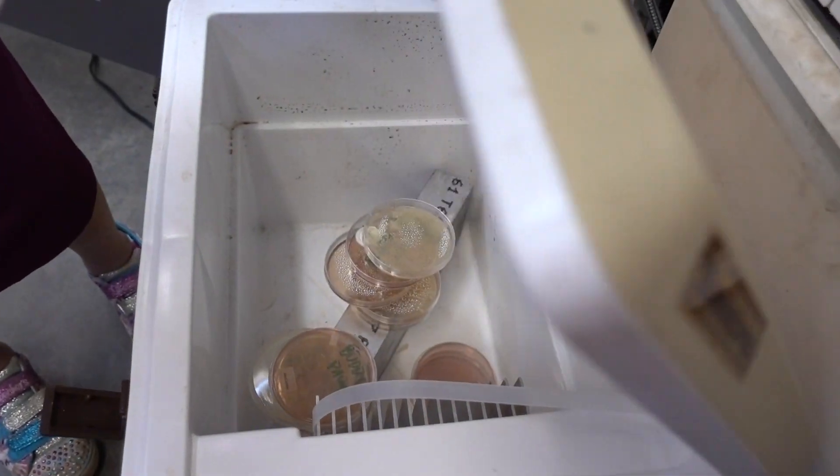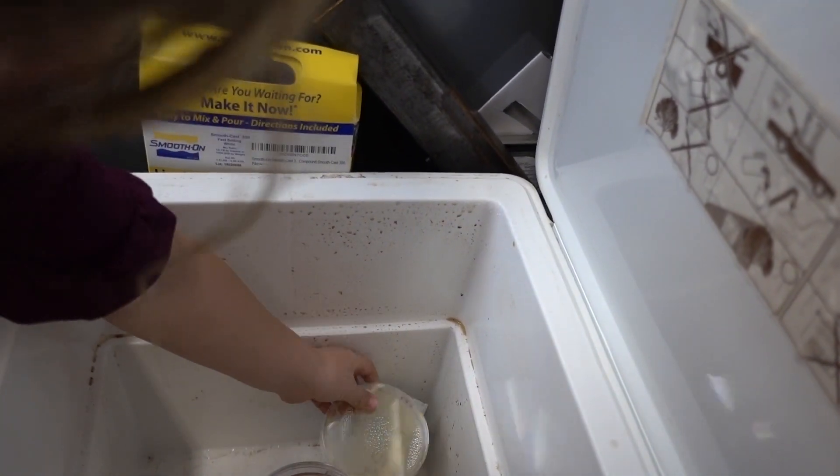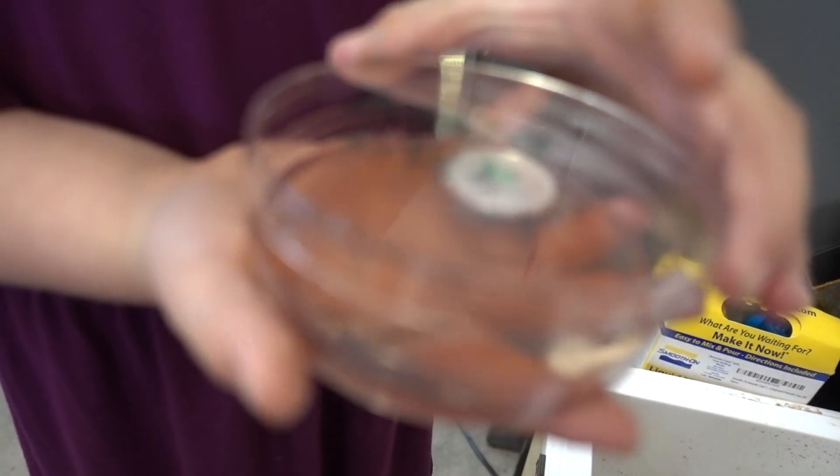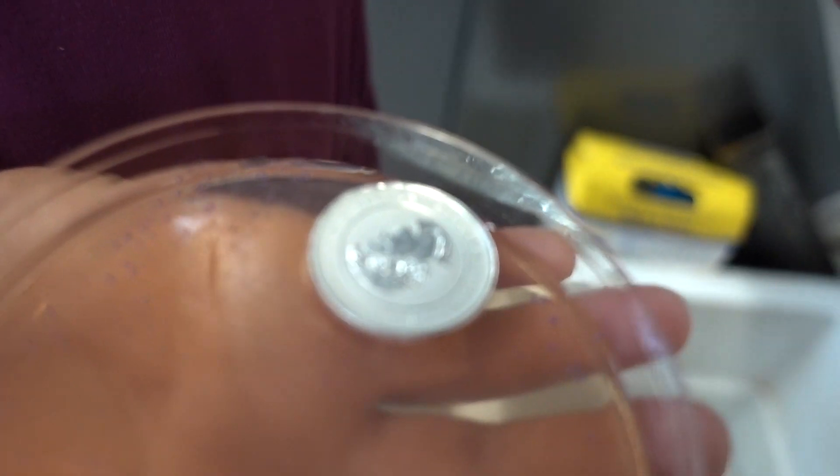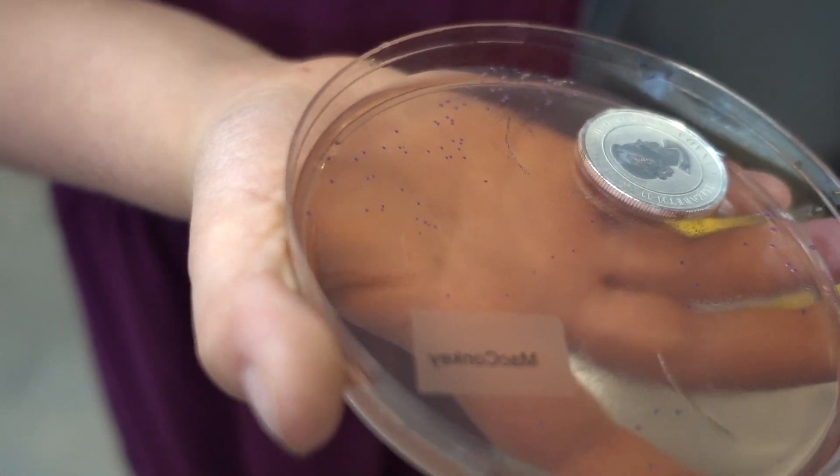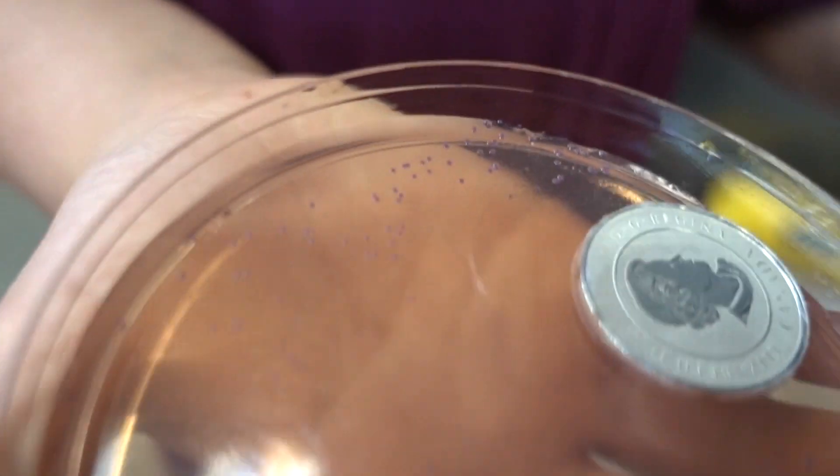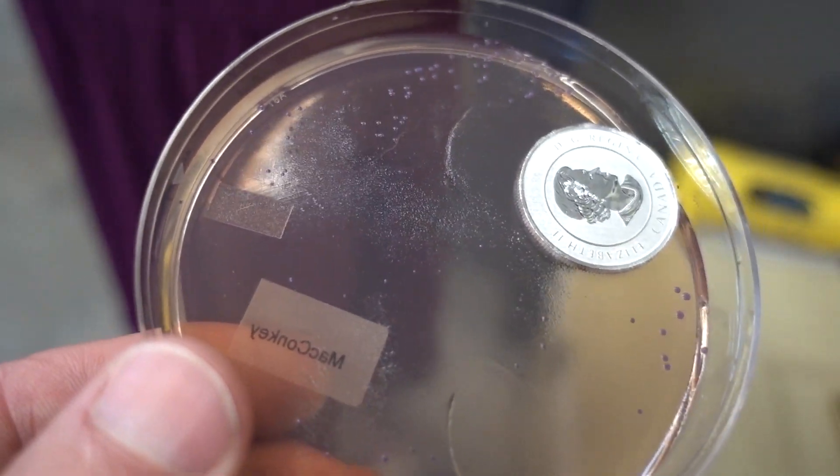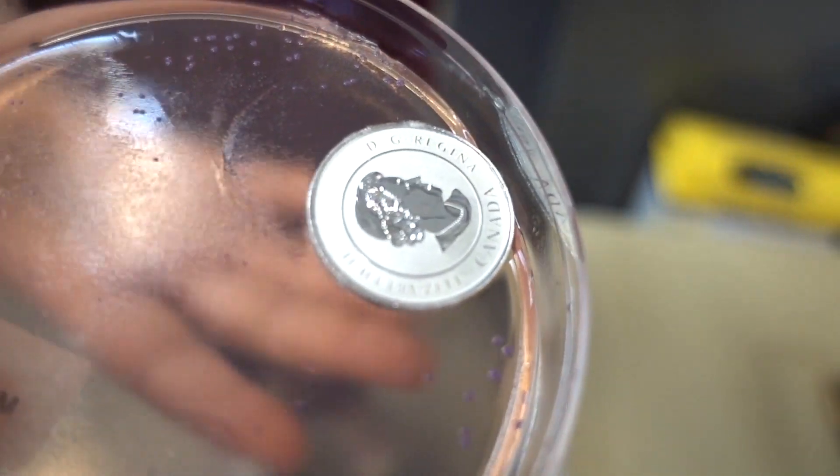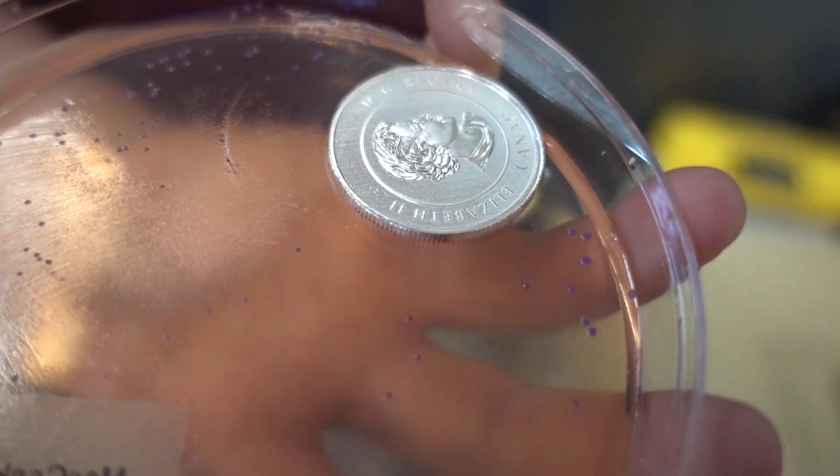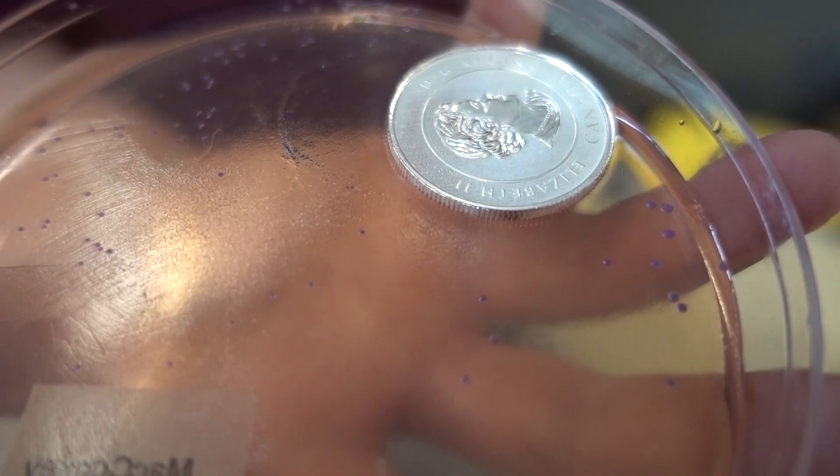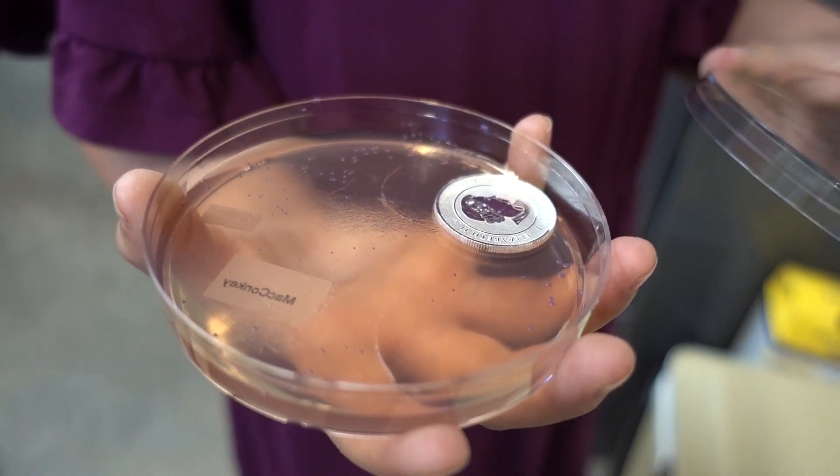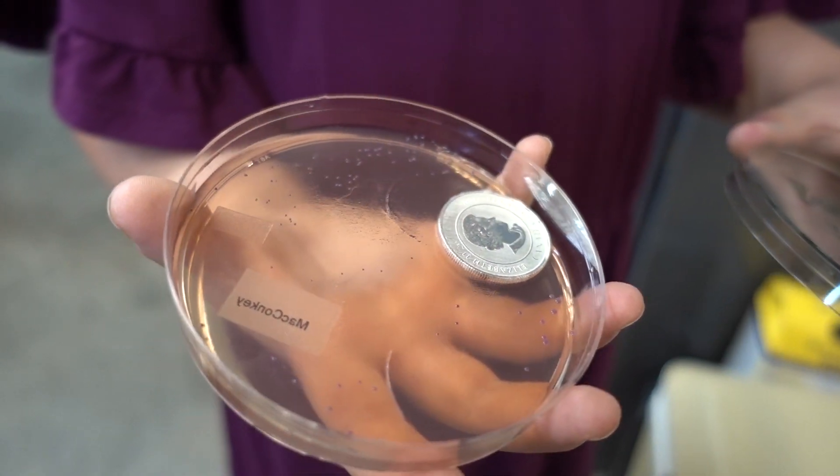Let's check the other ones. This one's Buddy's or mine. That's Buddy's. Remember you put the silver coin? All over my hands. Those are some interesting ones. They're purple ones! Yeah. So that means that these are lactose digesting because they made acid. But look, what do you see around the coin? Do you see any germs around the coin? No. It's like the silver killed the germs. Isn't that amazing? Cool.